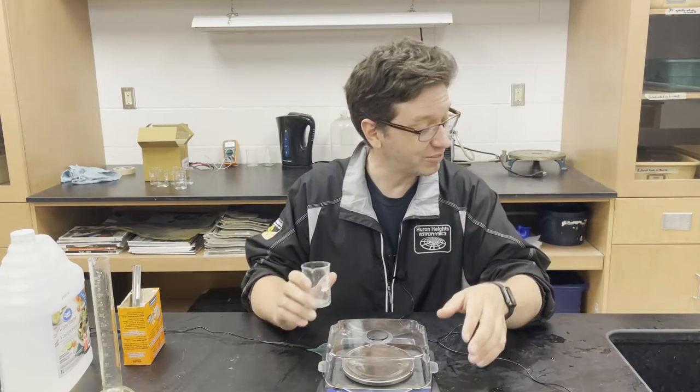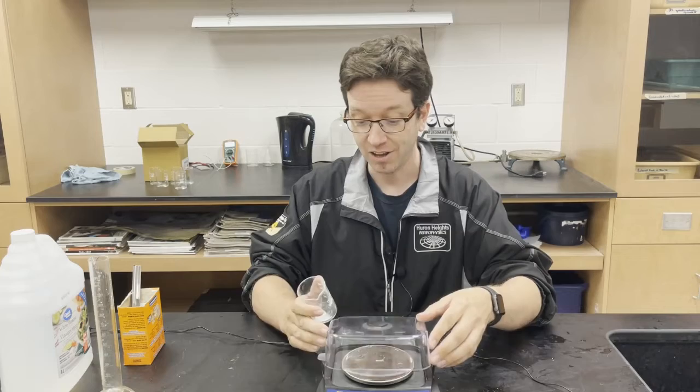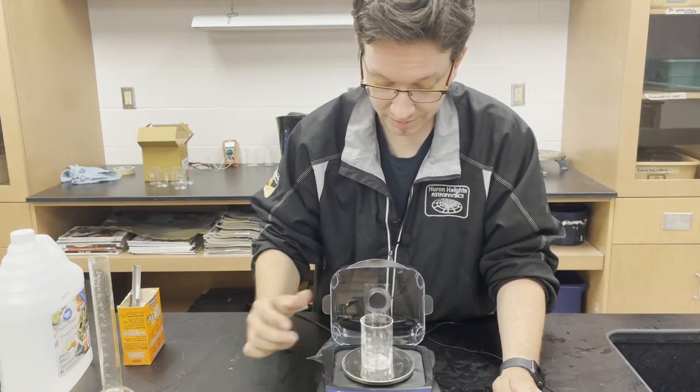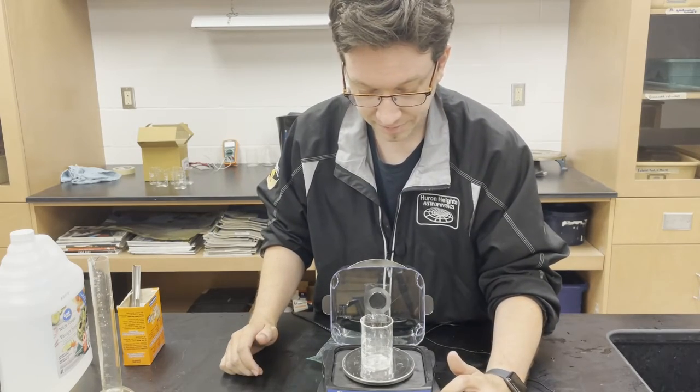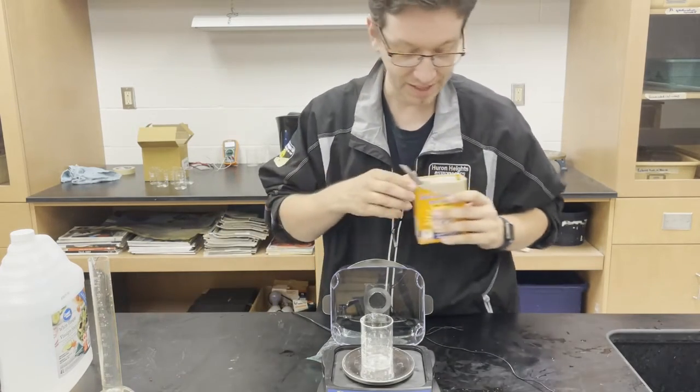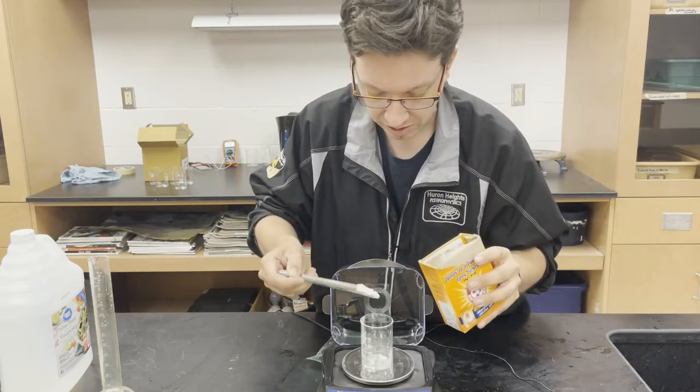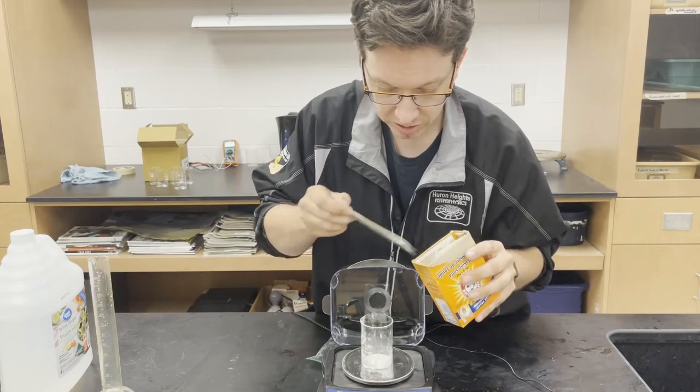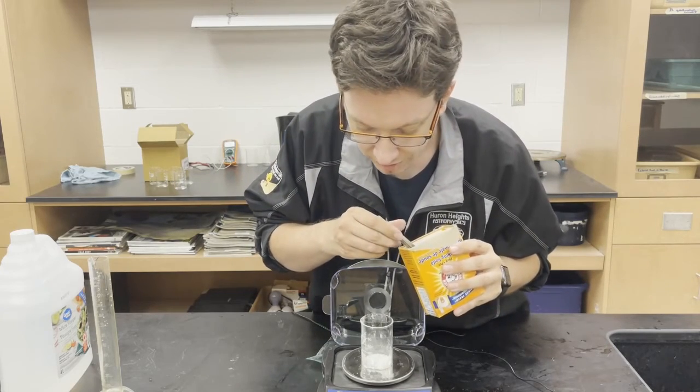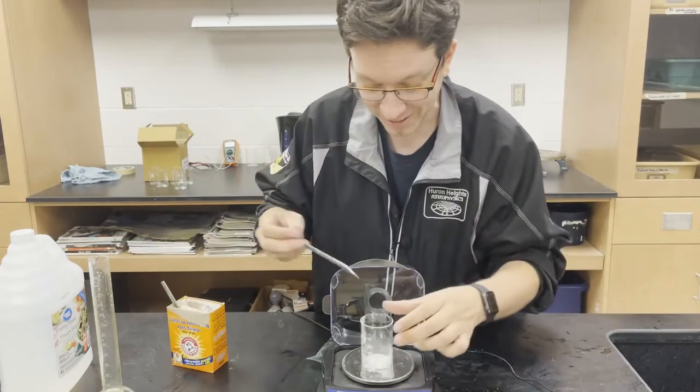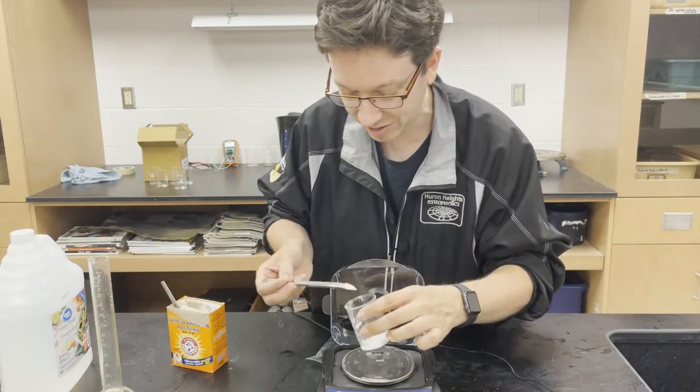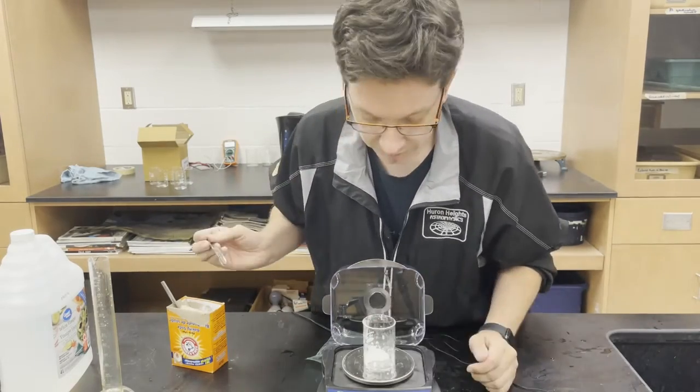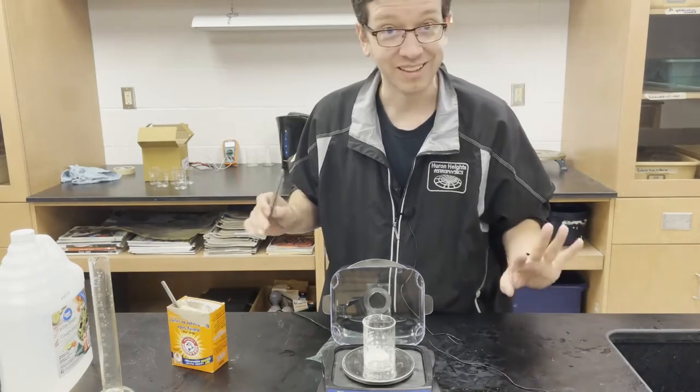Okay, so we need 2.714 grams of sodium bicarbonate or baking soda. So I'm going to take my scale here, put on a beaker, and then I'm going to re-zero. And then we need 2.7. So that's 1.5. 3.4 is too much, so we need to get rid of some of that. 2.720. That's close enough.